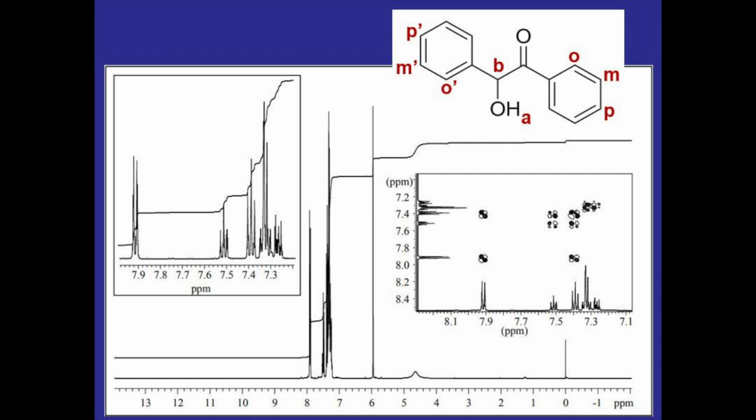This might look a little strange with the OMPs. They stand for ortho, meta, and para, and since the two rings are not equivalent, I'll label one of them as O', M', and P' to distinguish it from the other one. Please label your molecule the same way. This is just kind of how the key has it labeled, so it'll be easier for the TAs grading if everyone is consistent. There are a couple of helpful things on this NMR.